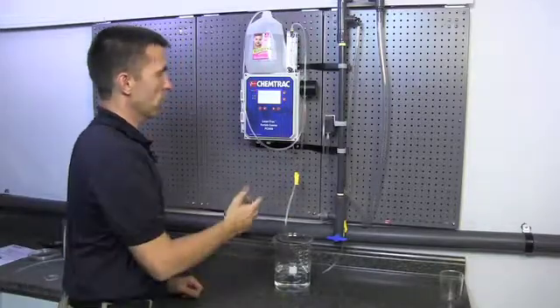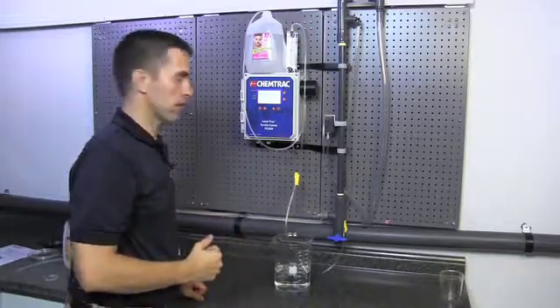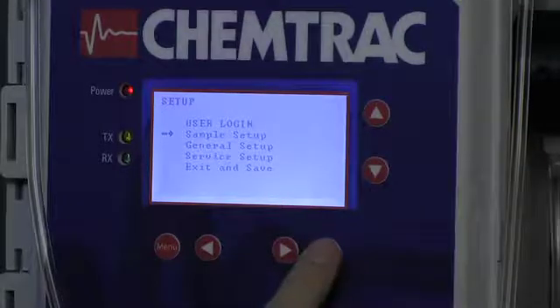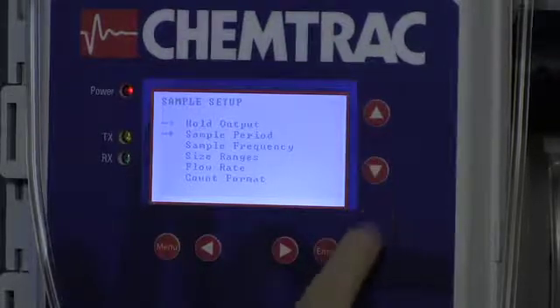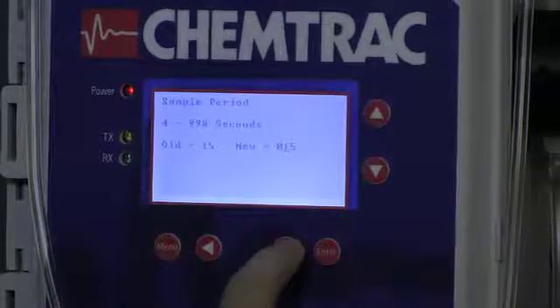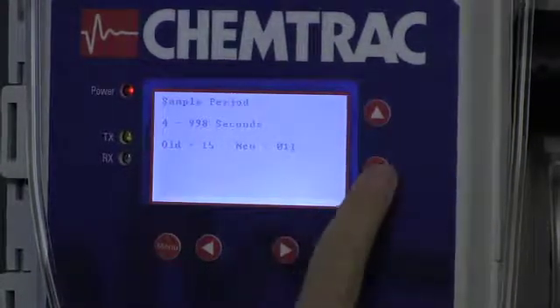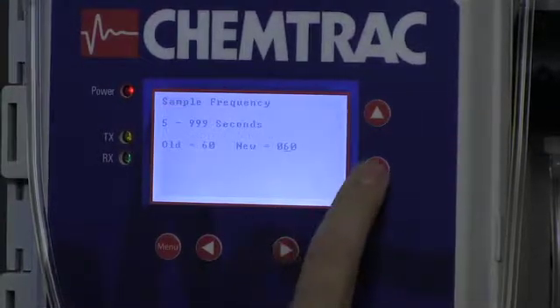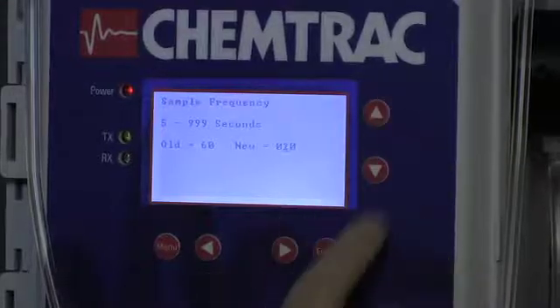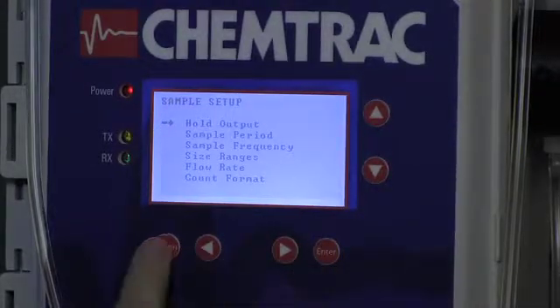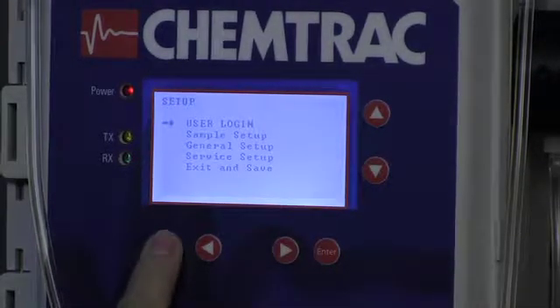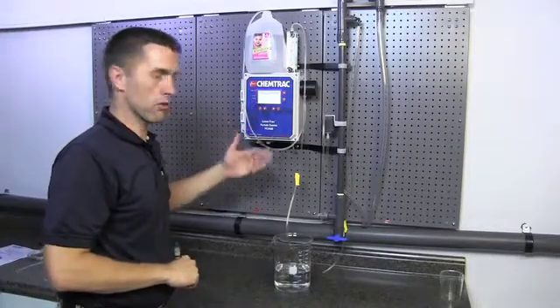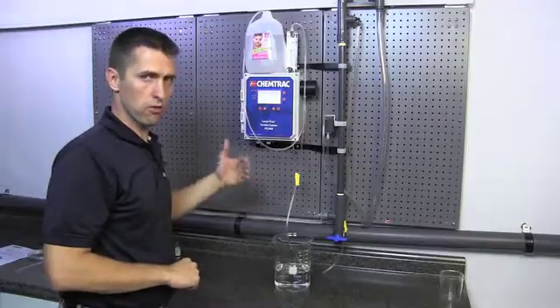Now, the next thing we're going to want to do is speed up the sampling frequency. So we're going to hit the menu button and go to sample setup. We're going to change our sample period to 10 seconds and our sample frequency to 20 seconds. Then we're going to hit the menu button two times to exit out of the menu. What this is going to do is speed up the sampling frequency so that we're getting a reading every 20 seconds versus once a minute.